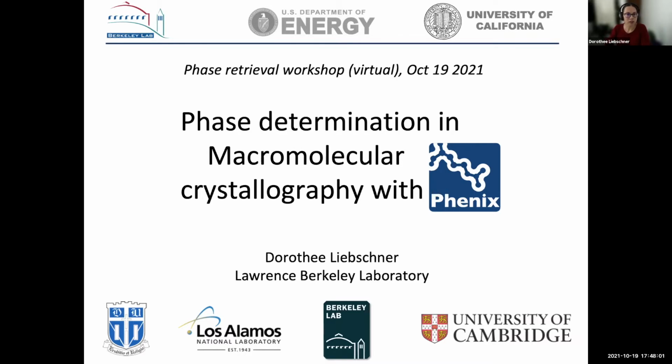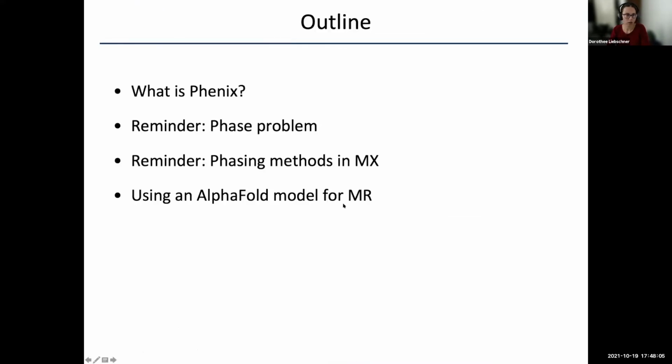So here's a short outline. First I will tell you what is Phenix, and then I will give you two reminders. One is about the phase problem. I know you heard it a lot, but I think this is a phase retrieval workshop, so the one thing you should take from this workshop is the phase problem. And then a second reminder about phasing methods in macromolecular crystallography.